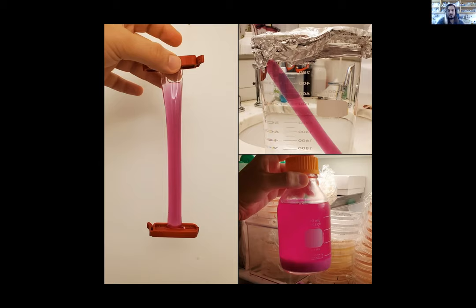Because one nice thing about this design is that it's laminar, and you can make a PCB so that everything integrates at the bottom or at the top of your bioreactor, and they fit like blades, like server blades in a server rack. So you can have a bio blade rack for biology, and each one can be programmed, and maybe a pull request for a poly feature that allows the bio blade to be modulated so you can do protein production and a little bit more hardware interfacing.